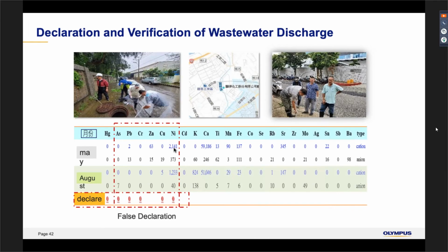Okay, I think there have been a lot of questions asking about soil environmental testing. So Prof, do you have any experience in this as well for soil environmental testing? Soil is a solid material, so it's already very common in use by XRF in our country.